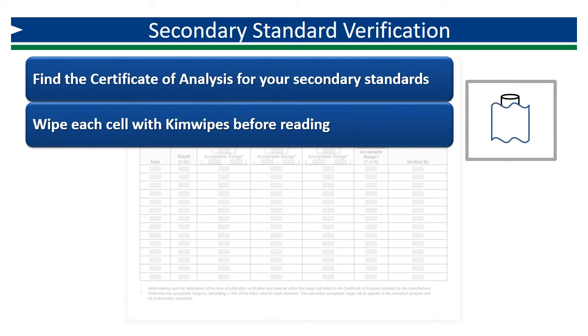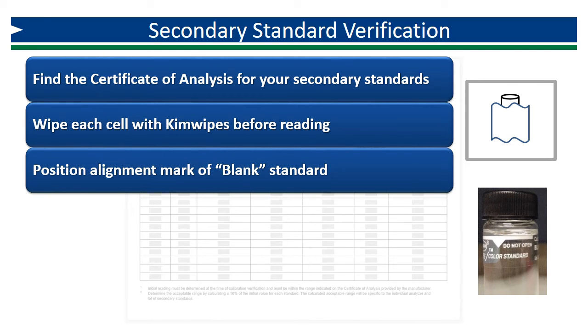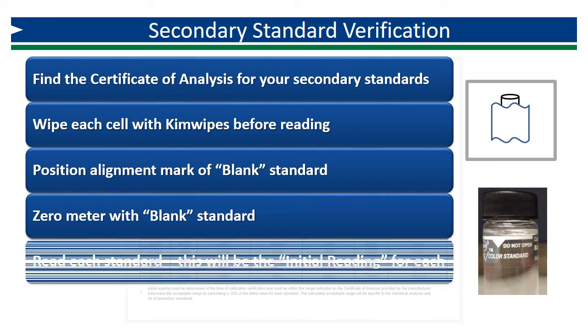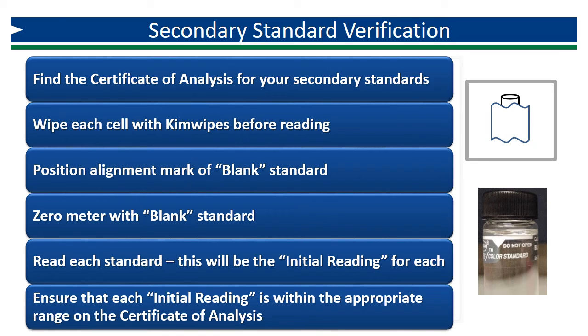Wipe each cell with Kim wipes prior to zeroing or reading. Start by inserting the blank standard into your colorimeter, being sure to insert each standard with the alignment mark positioned according to manufacturer recommendations. Zero your meter using the blank standard, then proceed to read each of the standards using the same technique. These results will be your initial reading for each standard once you confirm that they are within the manufacturer's recommended range on the certificate of analysis.